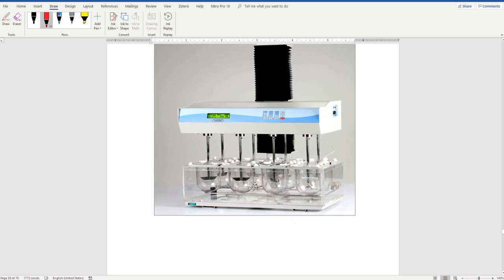Okay, now this is usually recommended by the United States Pharmacopoeia. That means when the United States Pharmacopoeia asks you to do dissolution test, usually it asks you to use apparatus 2, the paddle apparatus. Okay, for myself and from my experience, I prefer to use the basket apparatus, which is the British Pharmacopoeia.